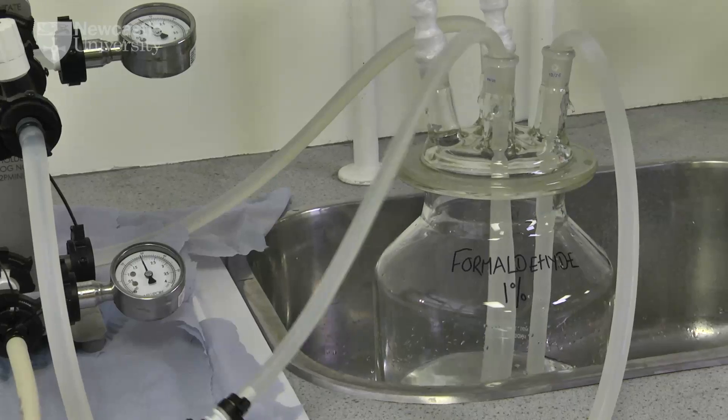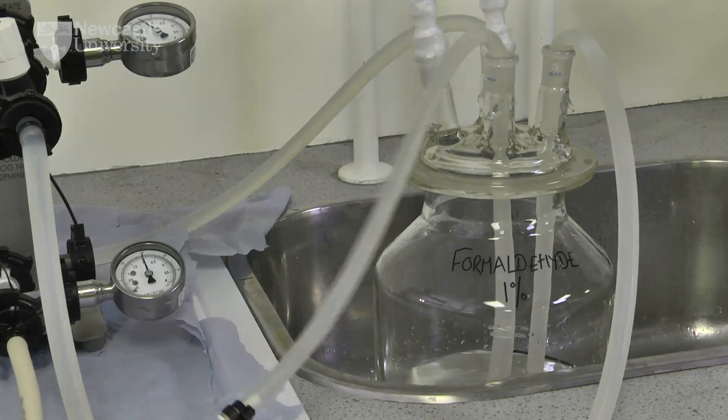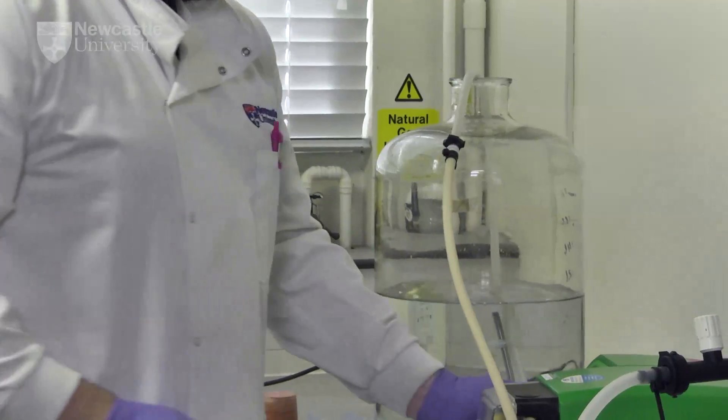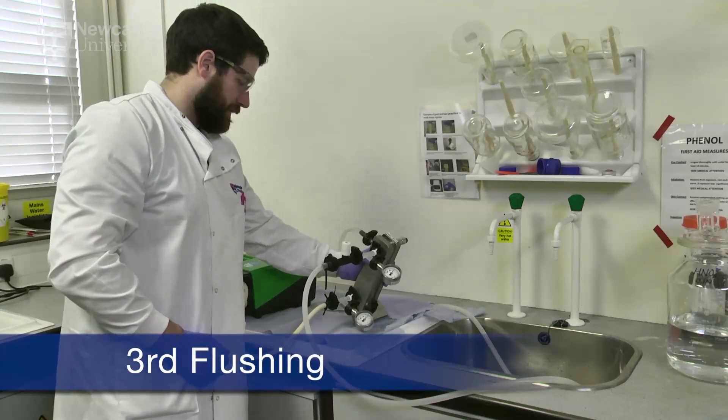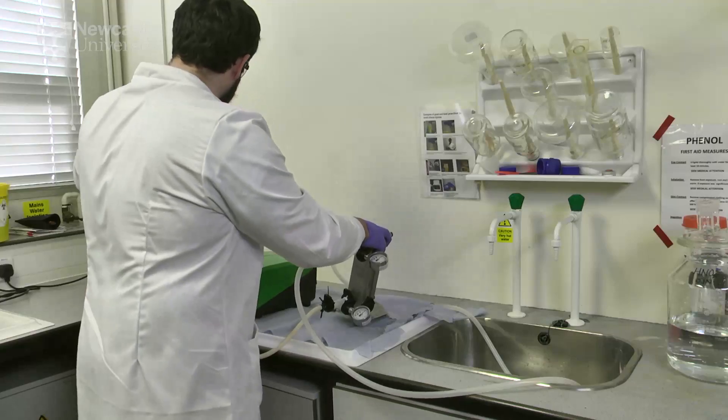The system is flushed once more as previously described. The normalised water permeability or the passage of clean water through the cassette under standard conditions can be used as a measure of cassette integrity.